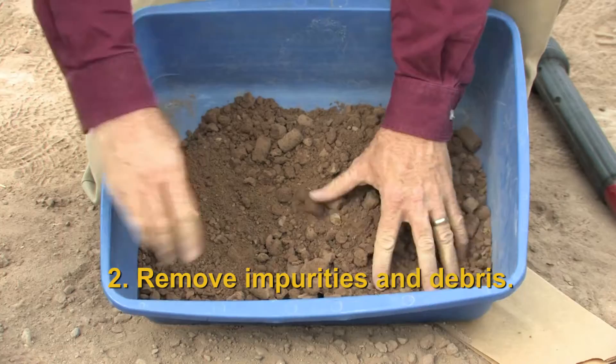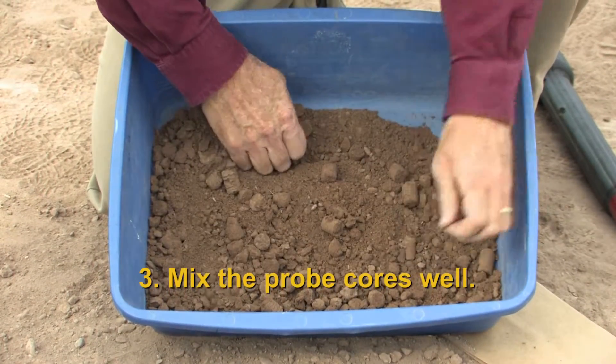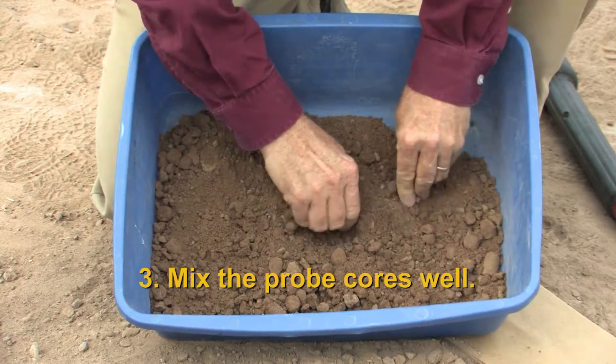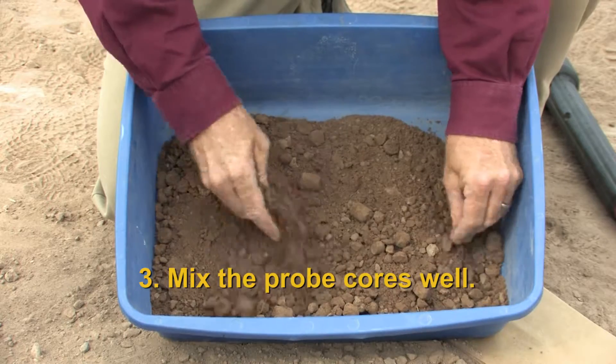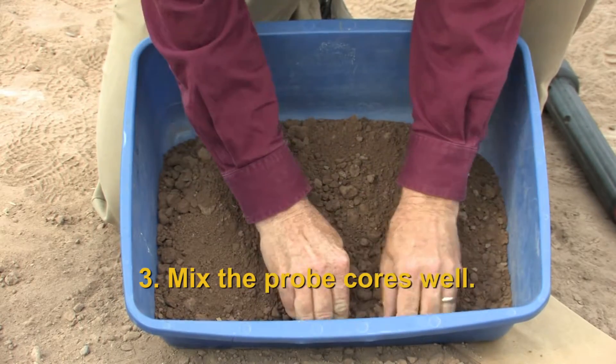Breaking up those clods also starts the process of mixing. We've taken cores from across a very large field, so we now need to make sure that they're very well mixed so a little bit of everything that was collected is in the sample.